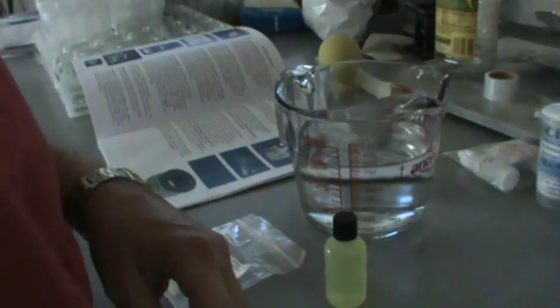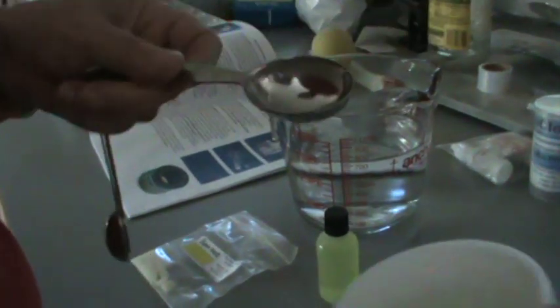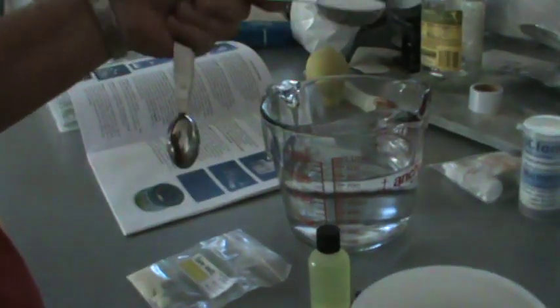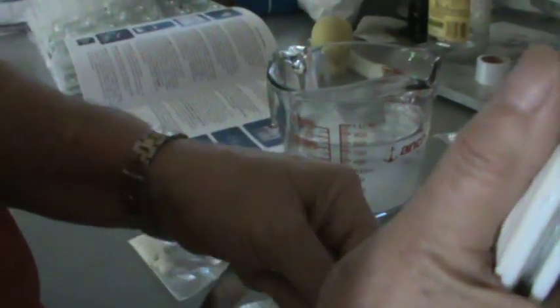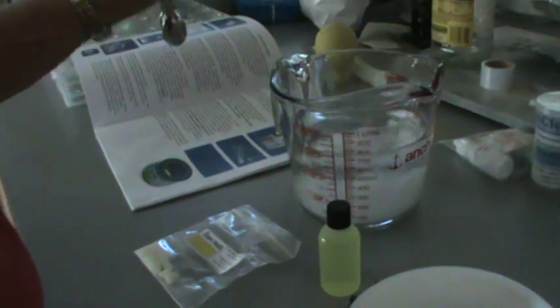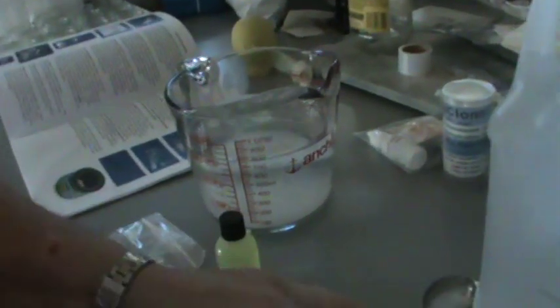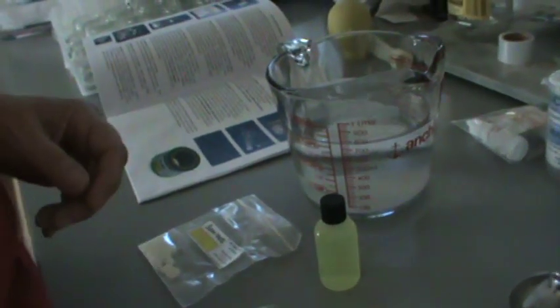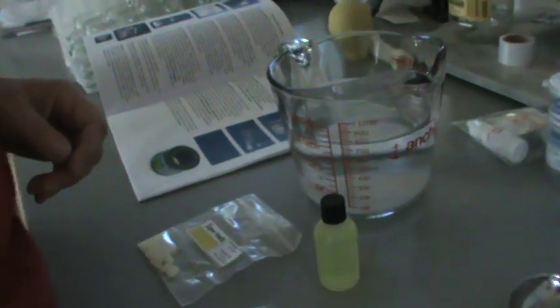I'm going to put the nutrients in first and put the gel in last. Actually I think I'm going to put the sugar in first because it may take longer to dissolve than everything else. So one tablespoon, two tablespoons. That gives the plant its energy and we're going to stir that.